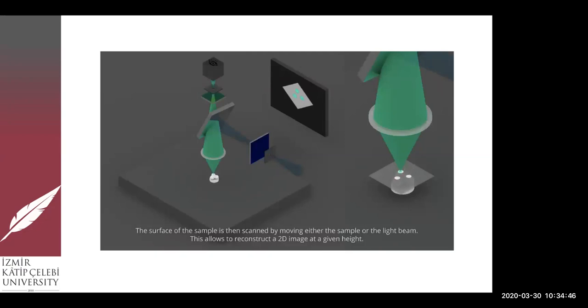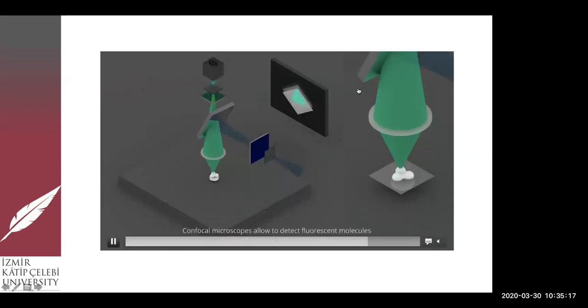We could not read, let's say, x equals 0 and x equals 1 at the same time. We should first finish the scanning at x equals 0 for that depth, and then move into another depth to enable the 3D sectioning. We could see how it moves, and the depth also increases to give a 3D structured image, as we will see now. And here is the 3D structure being shown.